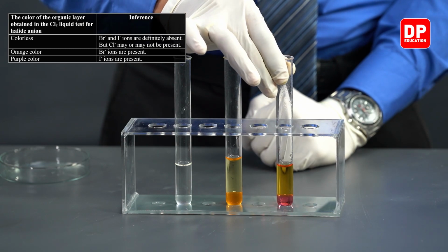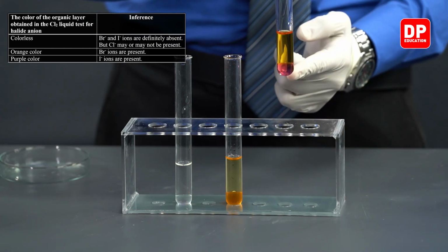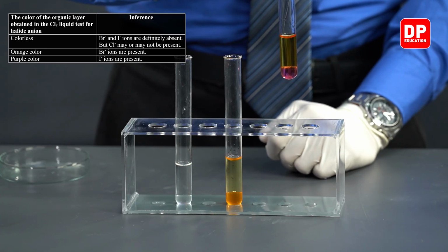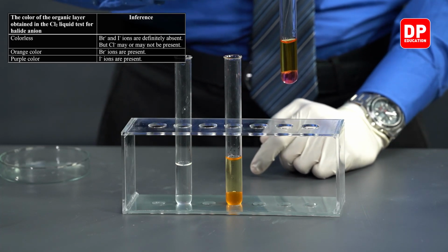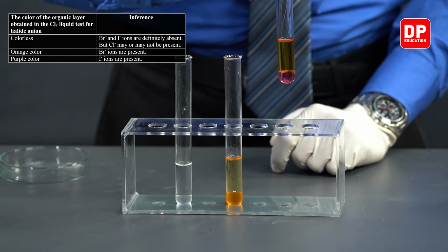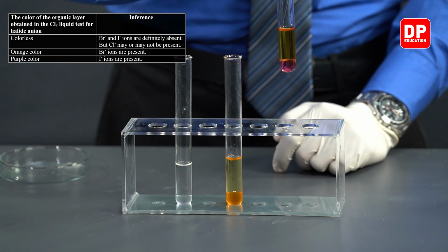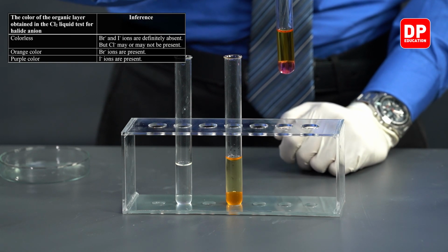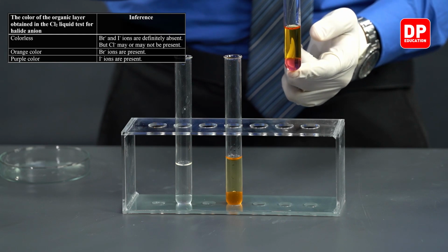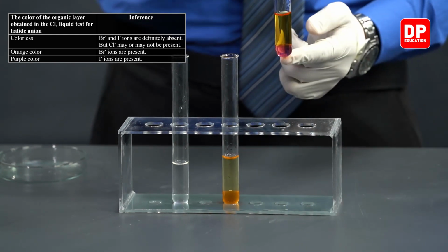And when we conducted the chlorine water test for iodide ion solution, we see that upon addition of chlorine water, the aqueous layer turned brown, and then when we shake it well with the organic layer, which is the carbon tetrachloride layer, the organic solvent will turn purple.